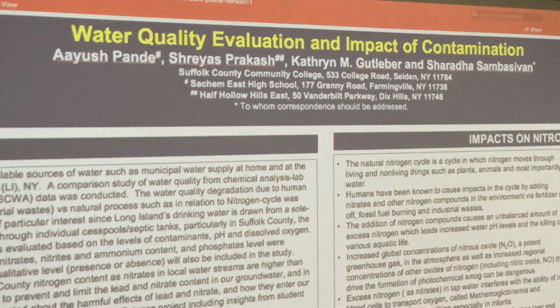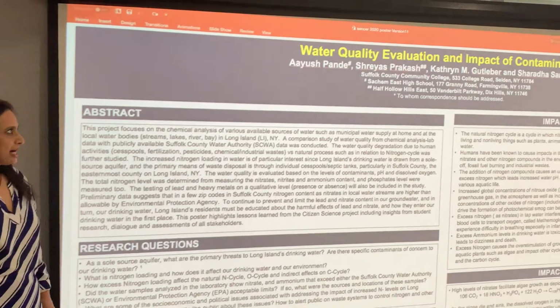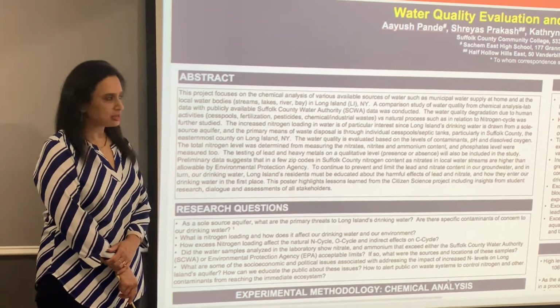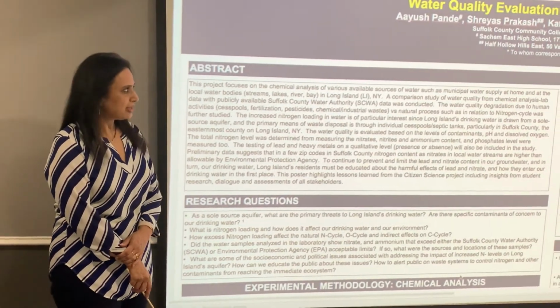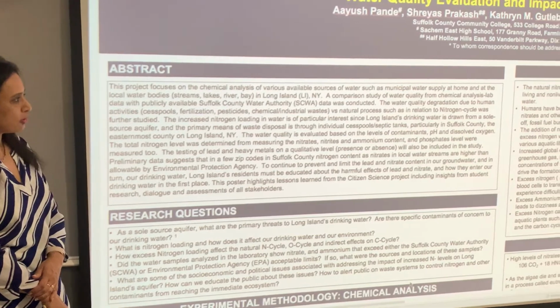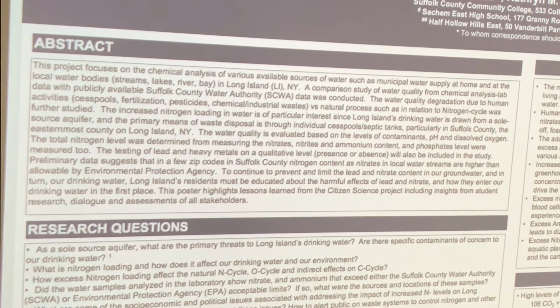We are going to talk about water quality evaluation, chemical analysis, what we find, and how it impacts the several natural cycles of nitrogen and oxygen. So our project mainly focuses on getting water samples from tap water and other water resources around us, and doing simple chemical analysis.